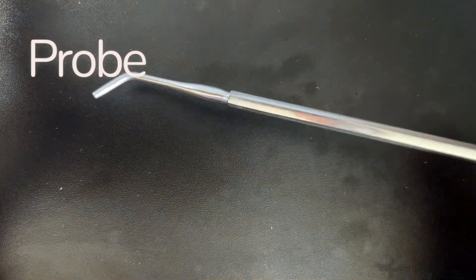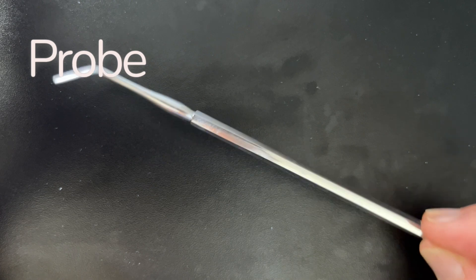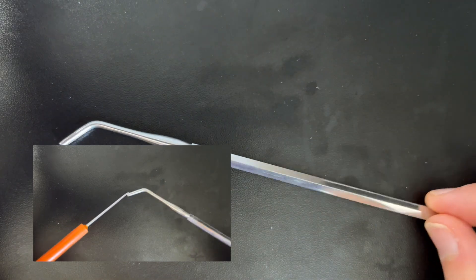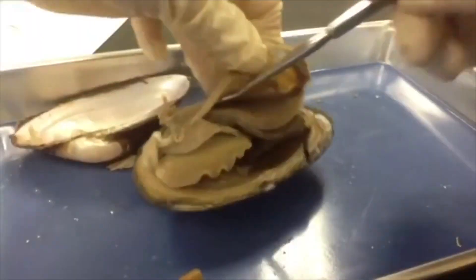Next up, we have our blunt or dull probe. This is a really useful tool used to manipulate specimens and probe openings. Sometimes we can use it together with the fine tipped or dissecting needle in order to separate and better visualize different parts of the specimen.